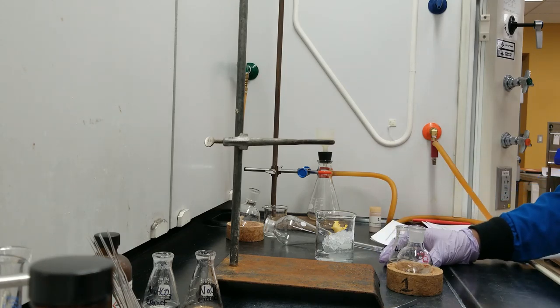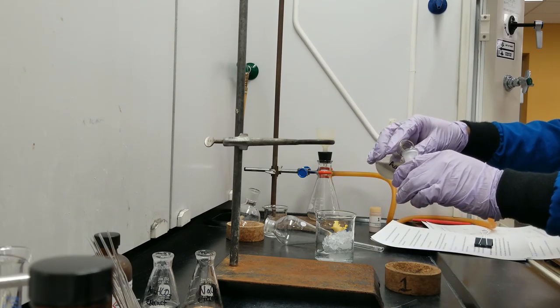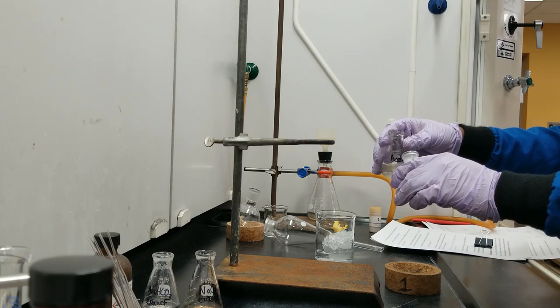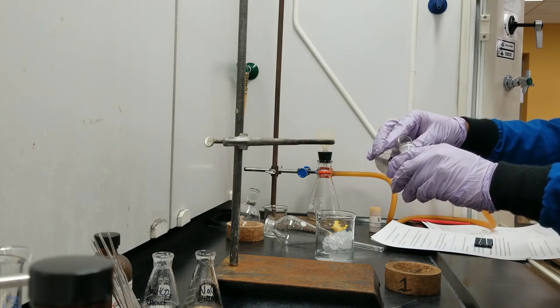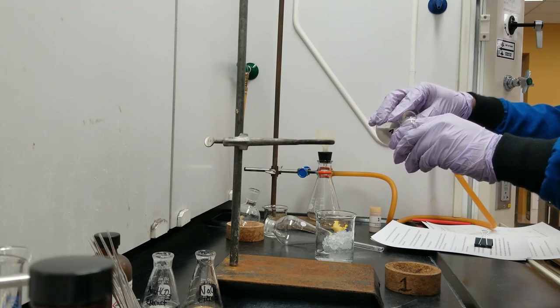We can either filter it or we can just decant it. I'll be decanting it. Make sure that you're not putting solid into the round bottom flask.